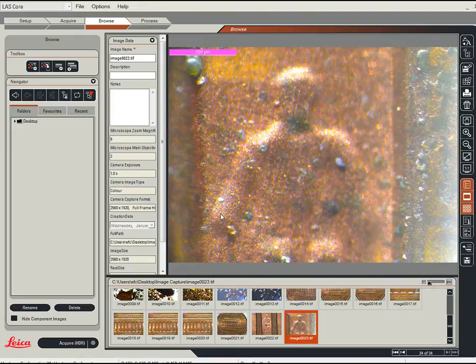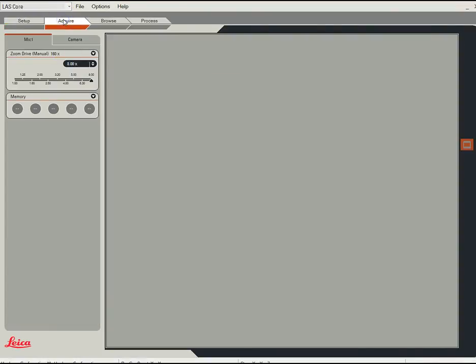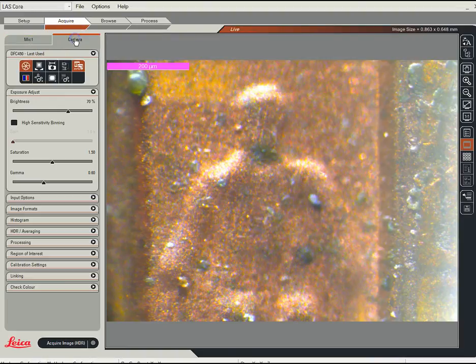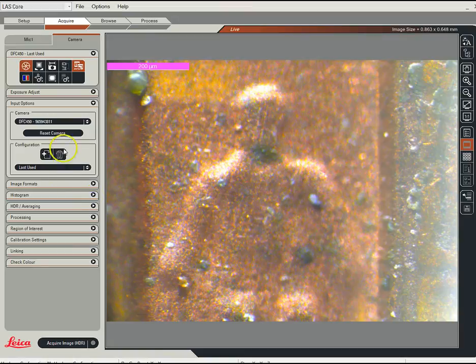So that's pretty much it. Remember just for setup, you have to tell it which objective you're using. Acquire is the setting you want when you're going to take a picture. Remember you can look at the microscope set tab and tell it the magnification. You can go to the camera tab and play with the exposure if you want. Remember if you screw things up, you can always reset the camera, which is really nice.